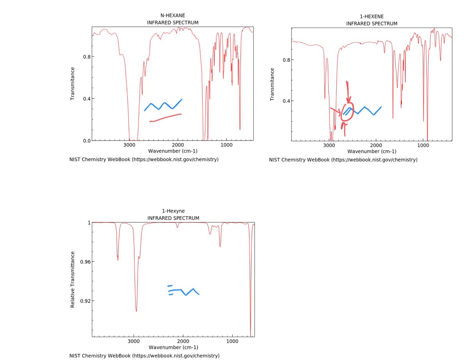Then when we have the triple bond, we notice some other things. See how this is fully broken apart now from that 3,000 peak, or the number that's a little bit above, or below 3,000. So we've fully moved away from that 3,000 peak, and we see a much more defined hydrogen. Now, one thing to keep in mind here is that when we have a C≡C triple bond, there's only one hydrogen there.